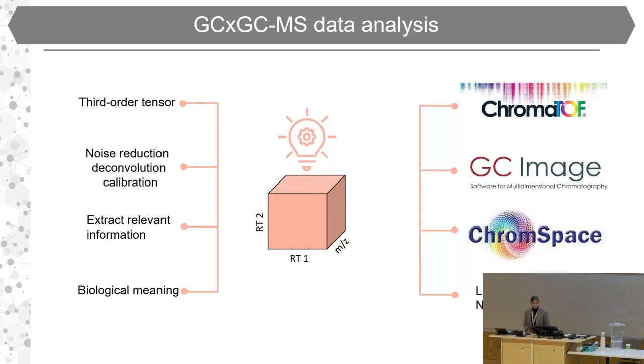At the same time, this complexity represents a significant barrier for new users, as effective data handling and interpretation requires a high level of technical and chemometric expertise. The data must be transformed into chemically meaningful information through dedicated data processing pipelines. In practice, these steps are often performed using commercial software. However, some researchers find that this software is not customizable, so they have problems automating all the processes.